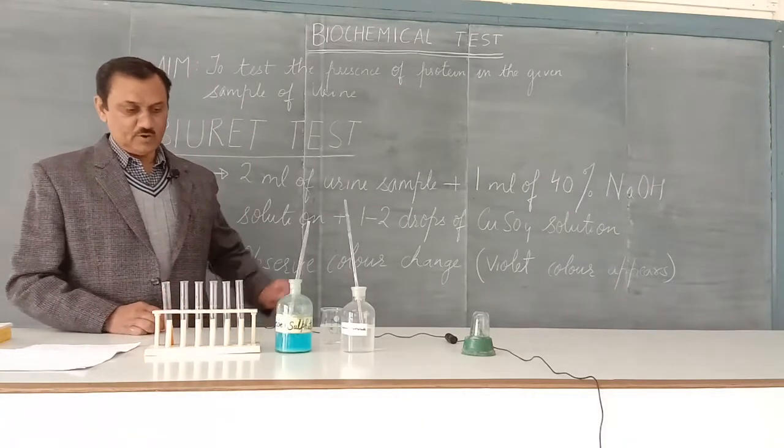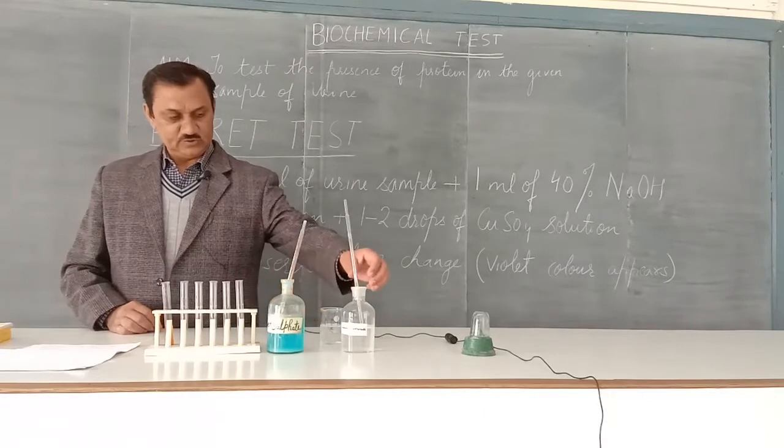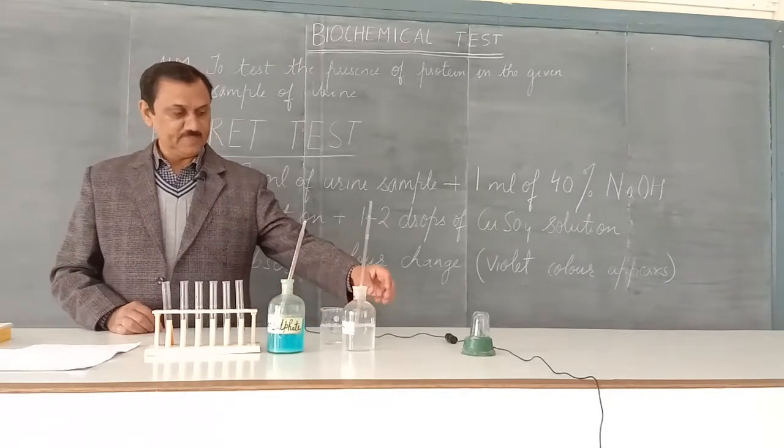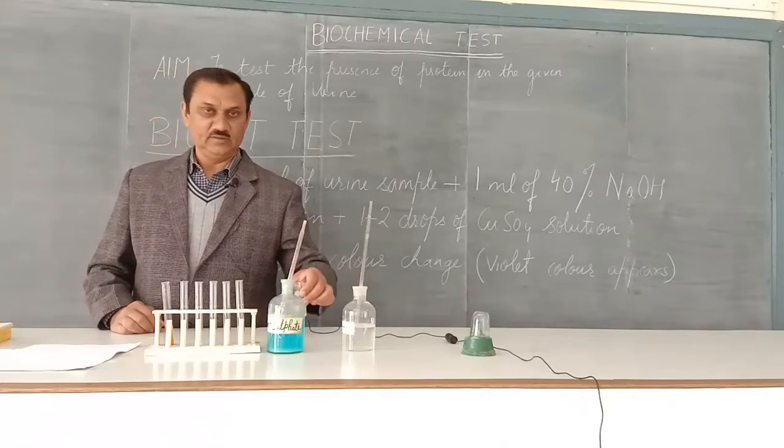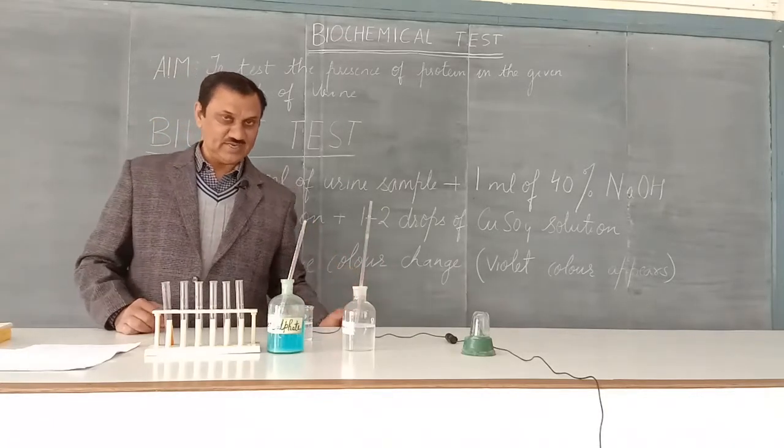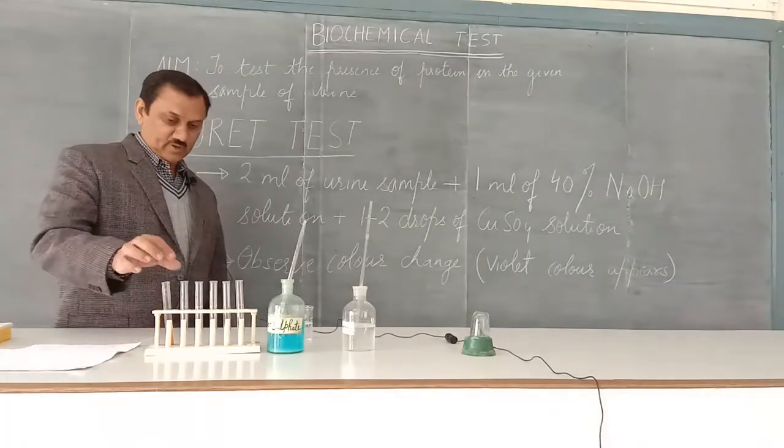test tubes, copper sulfate solution, sodium hydroxide solution, a spirit lamp, and a given sample of urine which we are going to test.